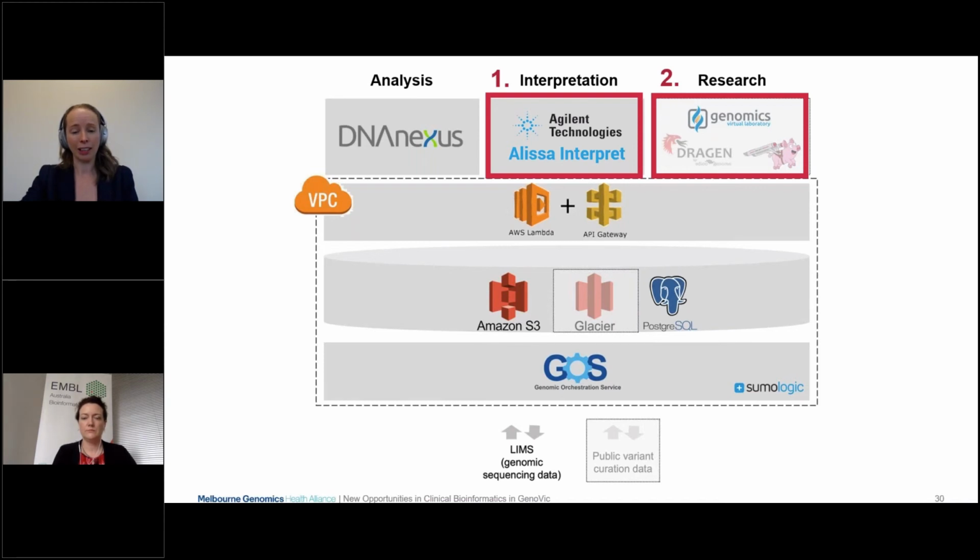Amazon S3. In particular, what we have to think about, other than storing it in S3 buckets, which many of you are probably familiar with, what I really care about a lot, is the way that we model the storage of that data, or the data model for storing that genomic data. So what other information do we have to store with a FASTQ file about who did it, when it happened, how long can that data be stored for, and so forth.